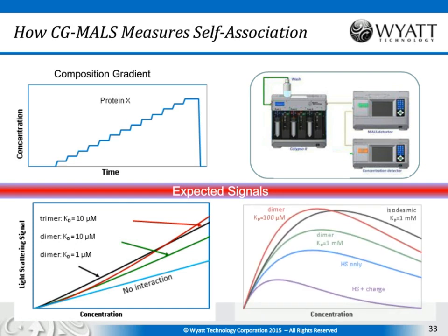When you go to much higher concentrations, actually some funny things happen, and I won't be delving into that right now, but if you're looking at concentrations of tens and hundreds of megs per mil, very interesting things happen in light scattering, and you can extract a lot of interesting information.